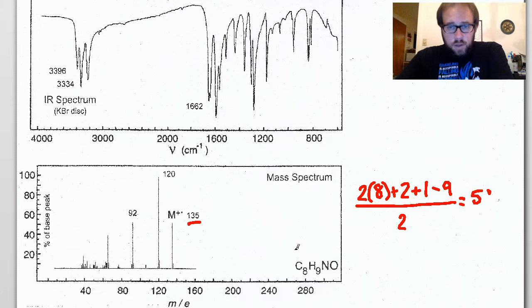I also did a video on this, so if you are confused between the M+ peak and the tallest peak, or the parent and the base peak, we sometimes call them, go ahead and check that video out as well.